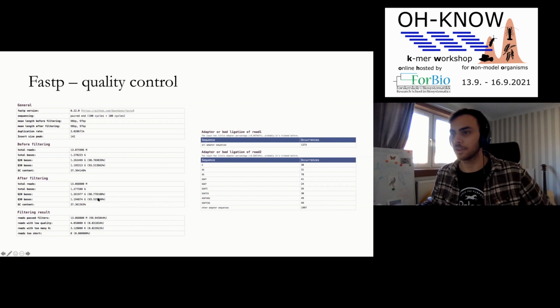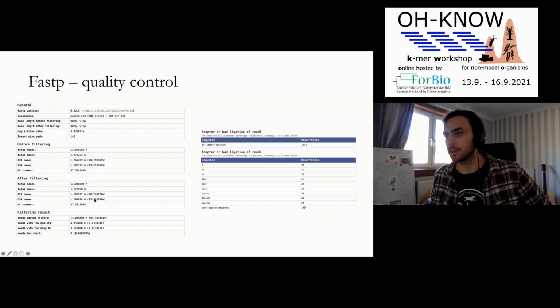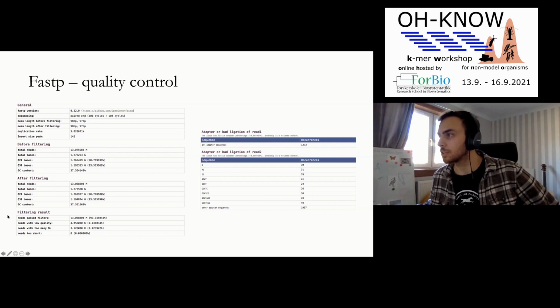Here it's actually run on, I think, an already filtered data set, but you can see there's still a marginal increase in things like the number of high quality bases. Here it's a very, very small increase. And it will tell you what you basically end up with at the end and how many reads it throws out if you give it some kind of conditions.